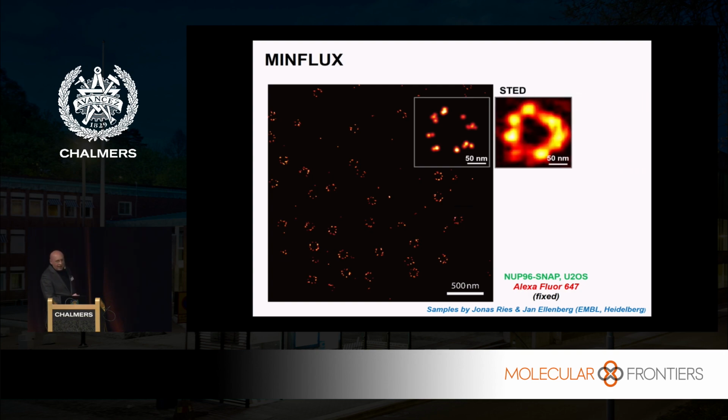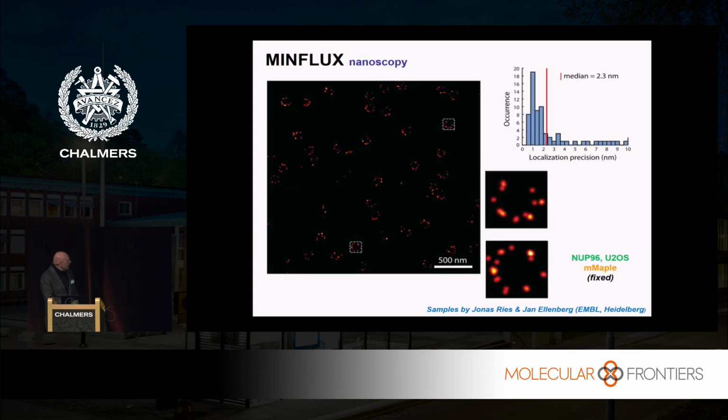I compared it with that, which won the Nobel Prize. And I'm comparing it with confocal microscopy, which I shouldn't do. Honestly, I feel sorry for those people who still use confocal microscopy, but, well, that's it for the moment. And you see now the evolution that has happened. Between here and here, it's a factor of 100. So it's quite a difference.